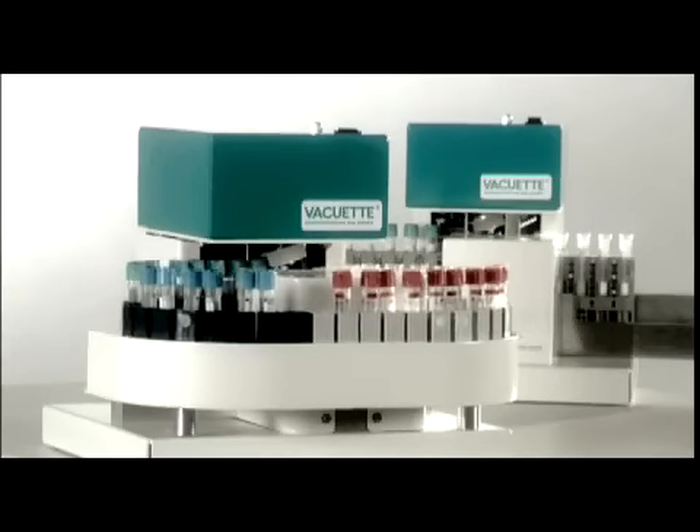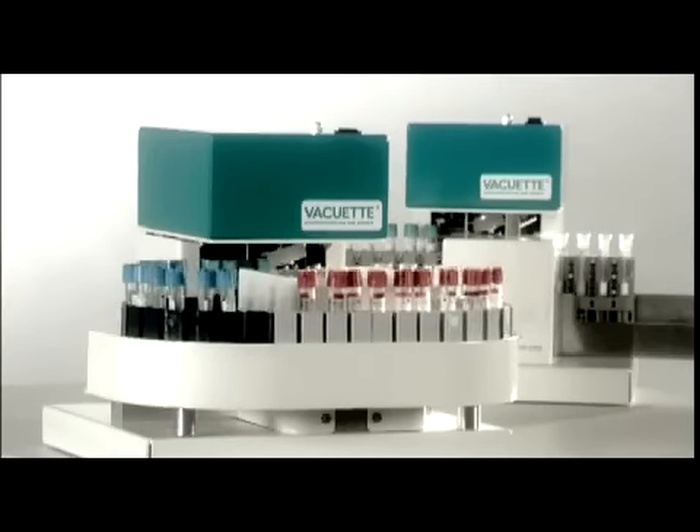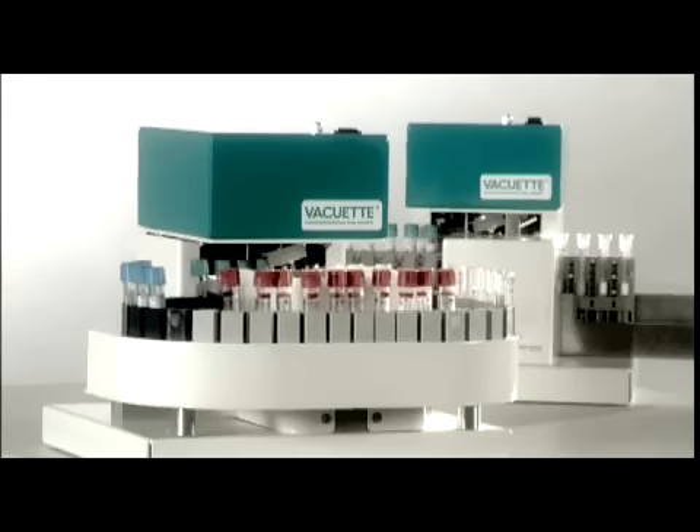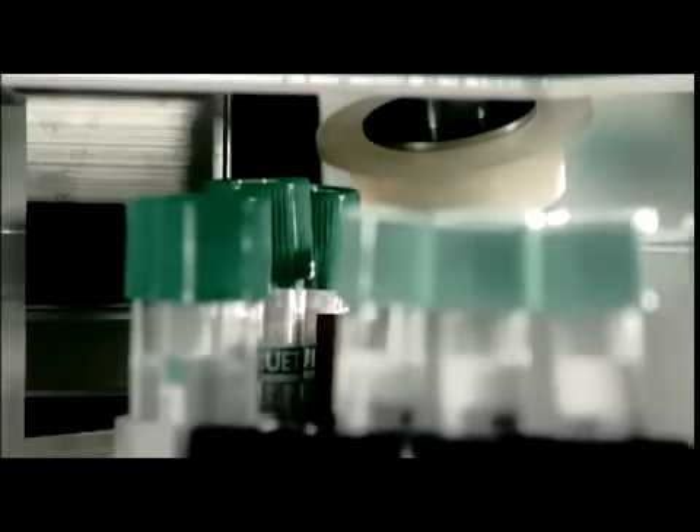The use of a decapping instrument saves time and minimizes the risk. The tubes are fed via plastic adapter links, which are simple to click together to form a chain.